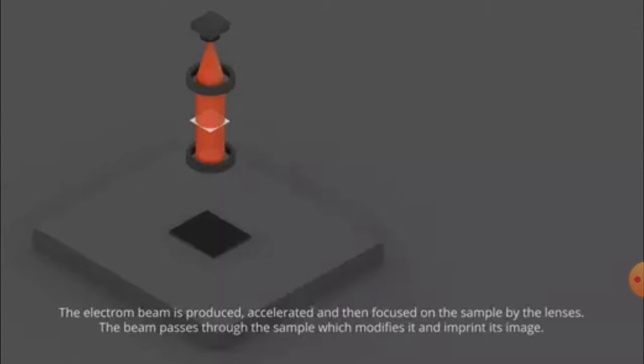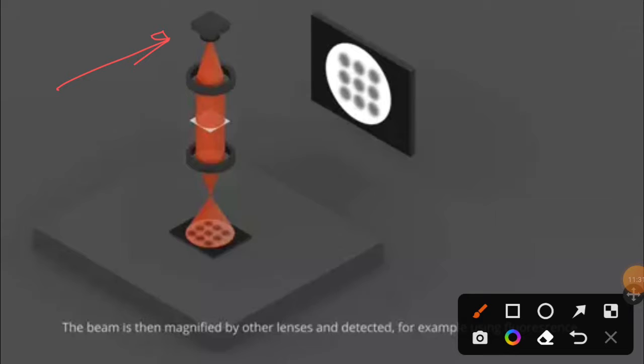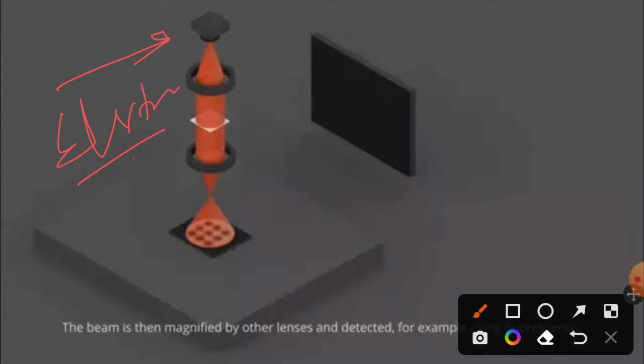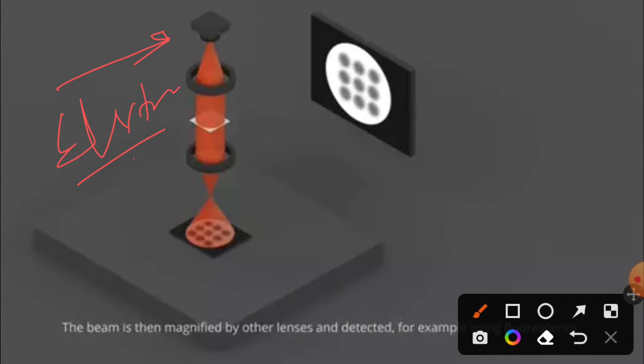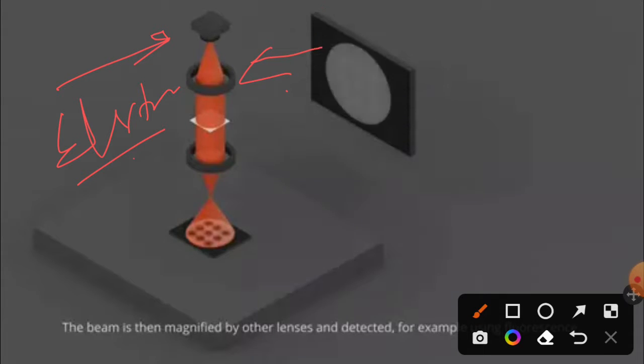So that is the idea of transmission electron microscopy. Here our light source is an electron source, and this electron source is a white hot tungsten filament in some cases that will provide a high voltage electron. This high voltage electron will be focused onto the specimen by the condenser lens. Again, this is a magnetic lens, not made of glass.